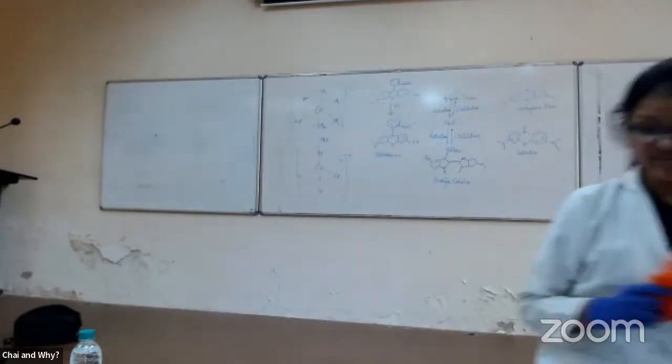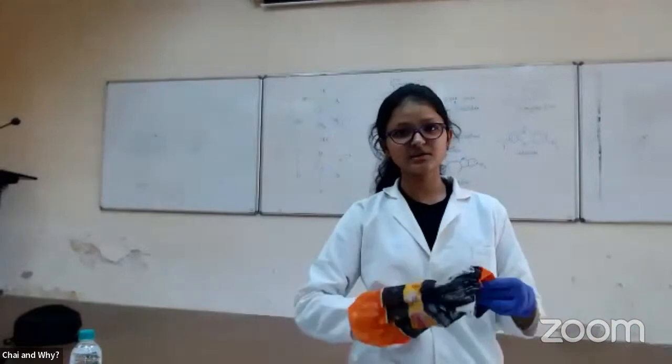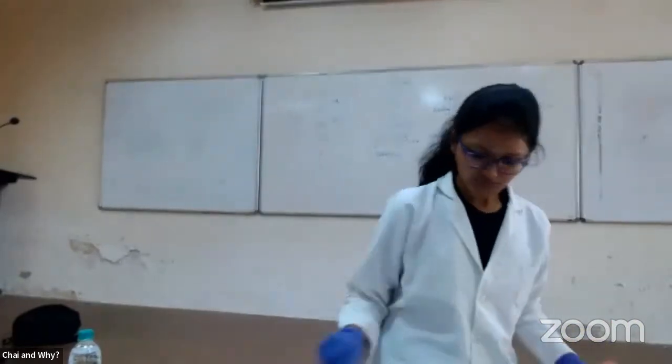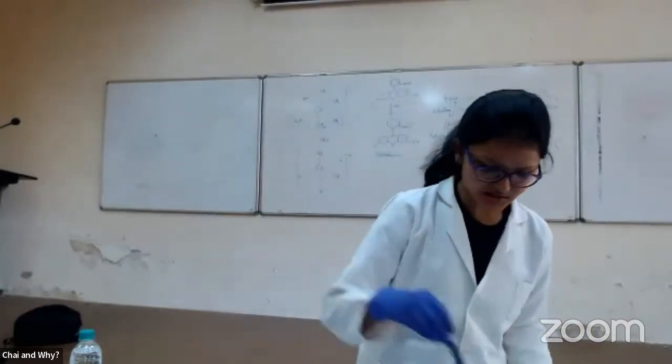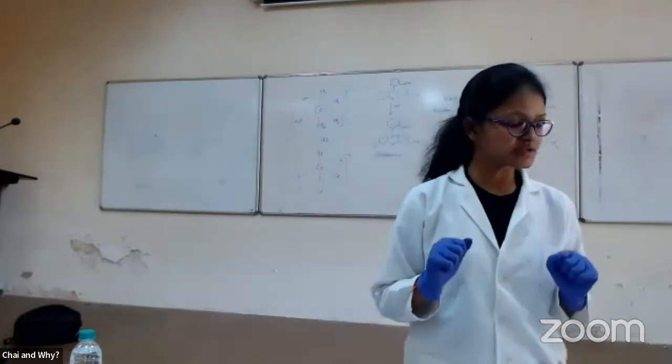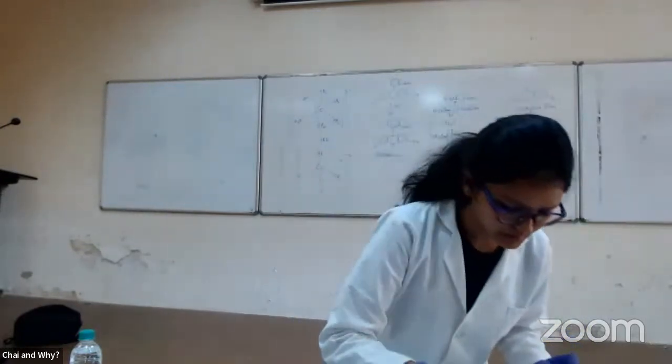So I have a little bit of ice remaining. I'll see if it goes back. So we will put it in this for a while, because I don't think it's going to work, but still. That's a big lump of ice. Okay, I think now we can go back to this.